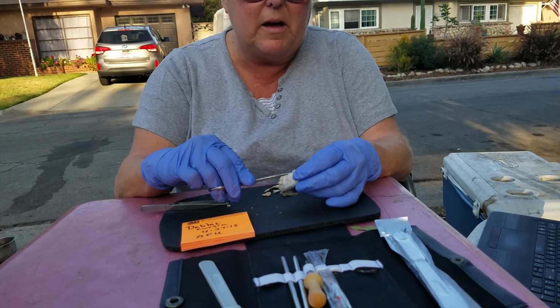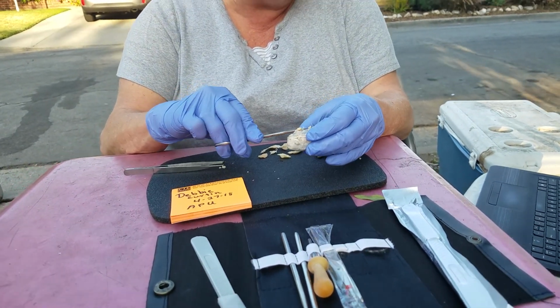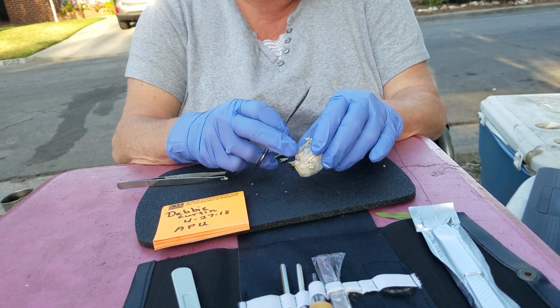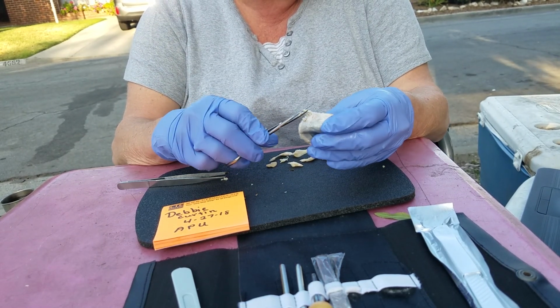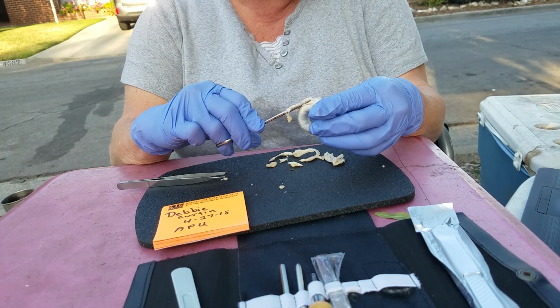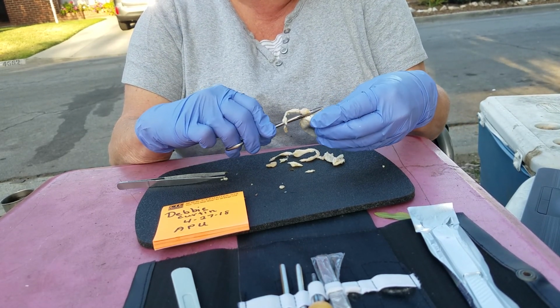We begin by trimming off the fat. Now what we're doing is exposing the optic nerve, which is right here. It feels a little tougher than the fat and it stands up on its own, it's erect. From here, after trimming off all the fat, we are going to cut into the retina.